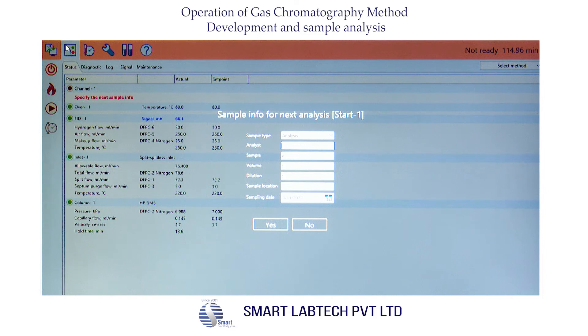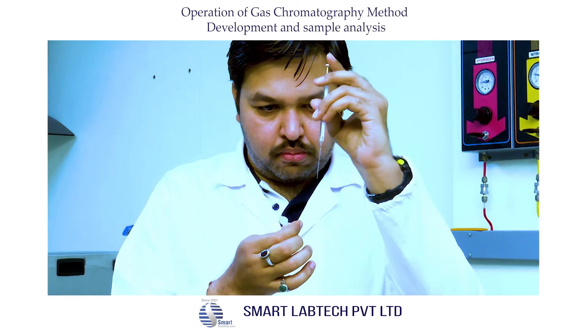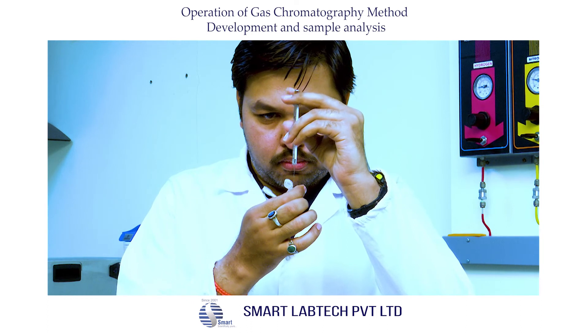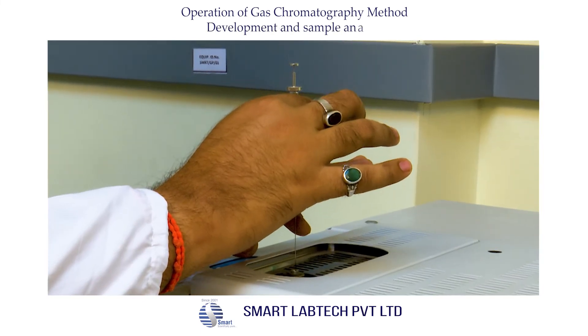After equilibration, enter sample information. Select 'Analysis' against sample type, enter the name of the analyst, enter the sample number against sample, and enter dilution — if not applicable, leave it blank. Feed the sample location if applicable. After feeding all parameters, click Yes, then wait for the instrument to be ready. Now take the syringe and take 0.25 microliters of sample — in this case it is isopropyl alcohol. Ensure that there is no air bubble trapped inside the syringe.